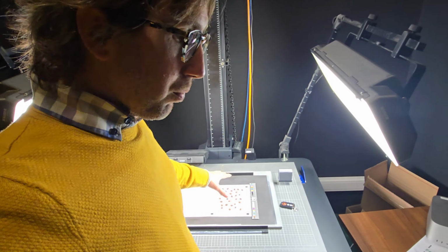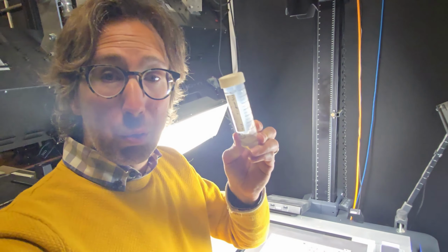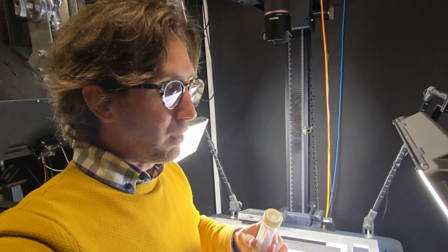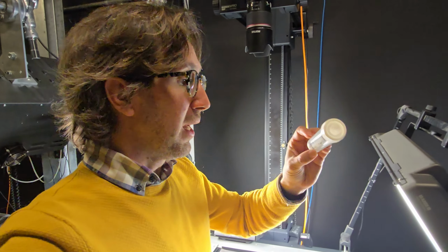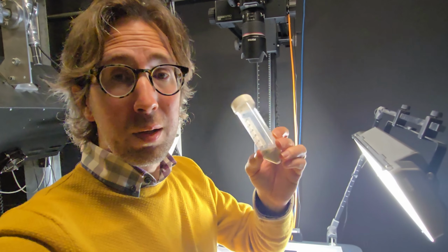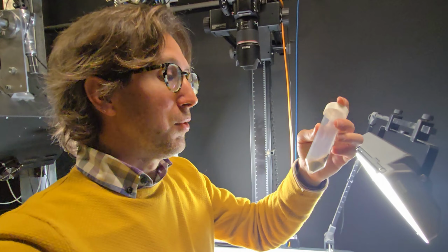Now, I was working on this problem because of the green coffee grinding issue I'm having for the research on tracing coffees, where we actually need to get as fine as possible a grind of green coffee, and I can already tell you it's just really not easy.